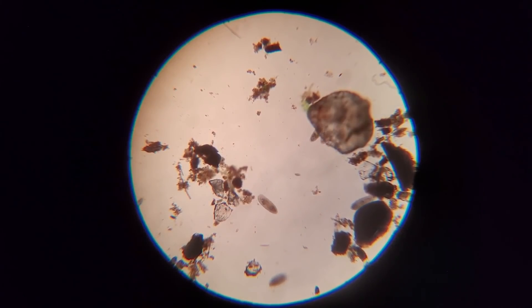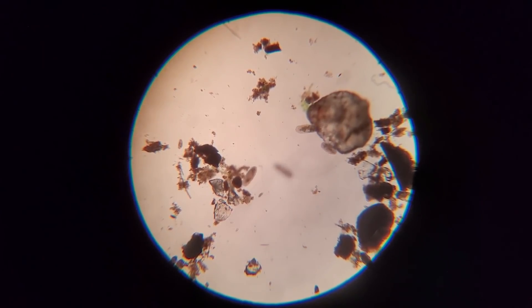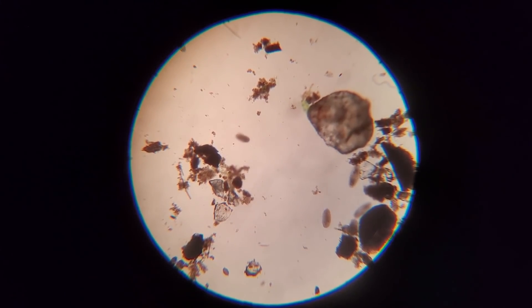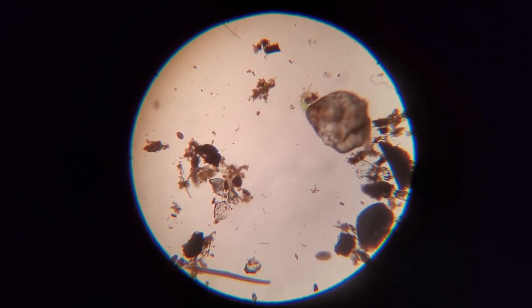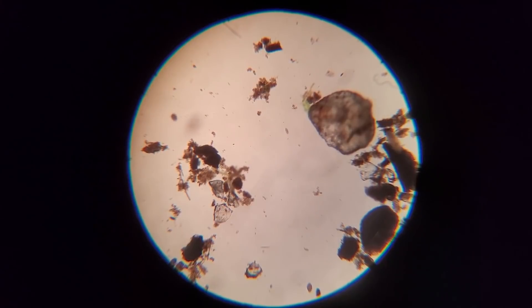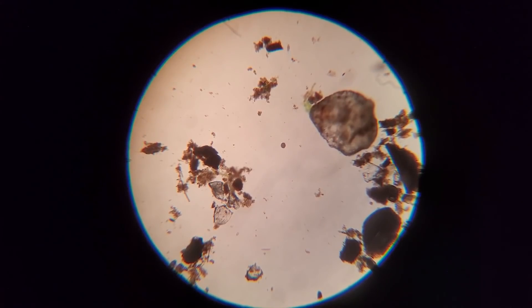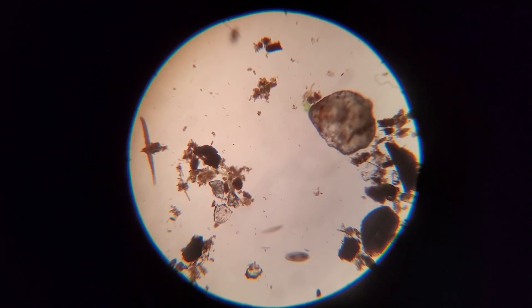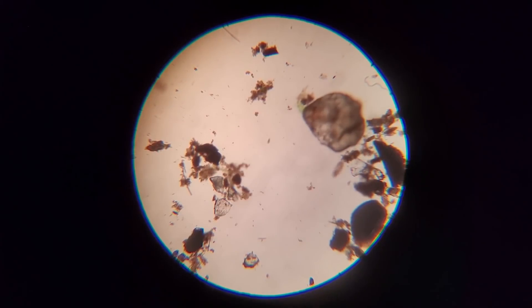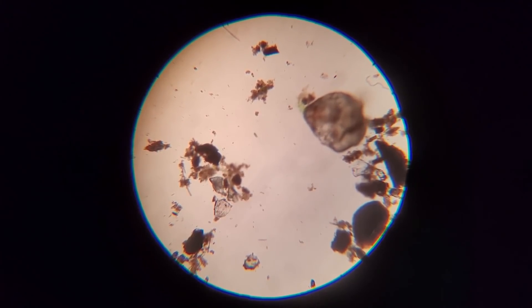Welcome everybody. What are we looking at? We are looking at a tank that is five, six, maybe even seven years old, that has had the same substrate, same dirt and soil in it, with different plants growing and all sorts of things. This is one droplet of water at 400 times magnification. We have over a dozen little life forms in here — everything from algae, the little green spot, to worms like little nematodes, to protozoa, to bacteria, which you can't even see with this microscope.